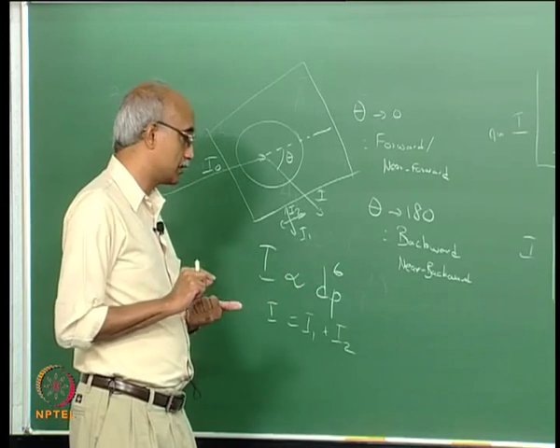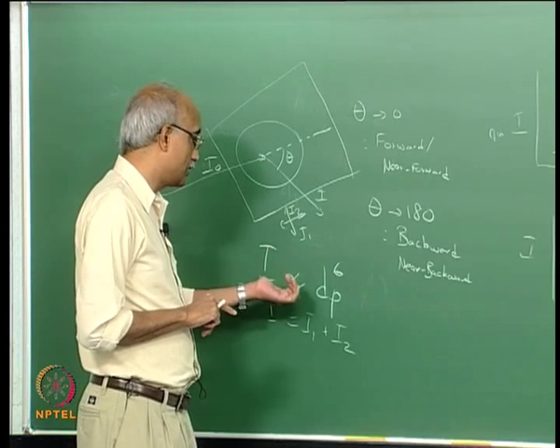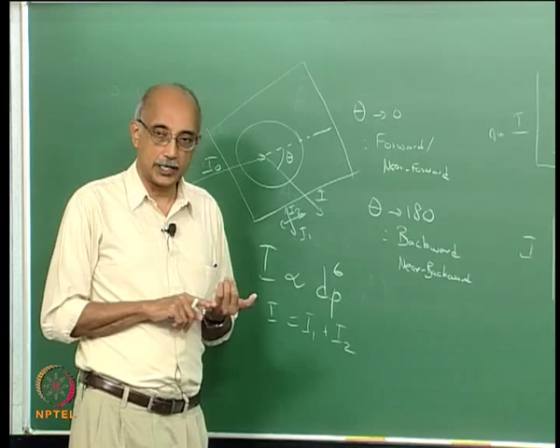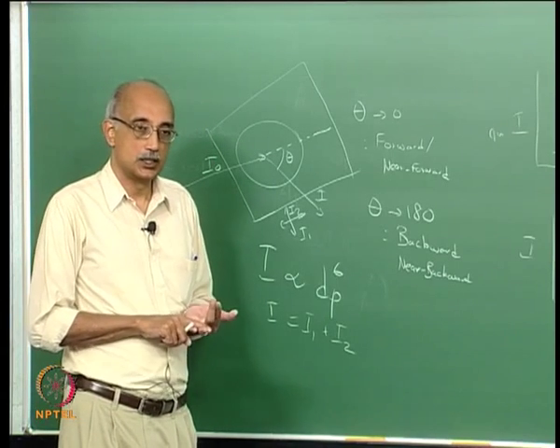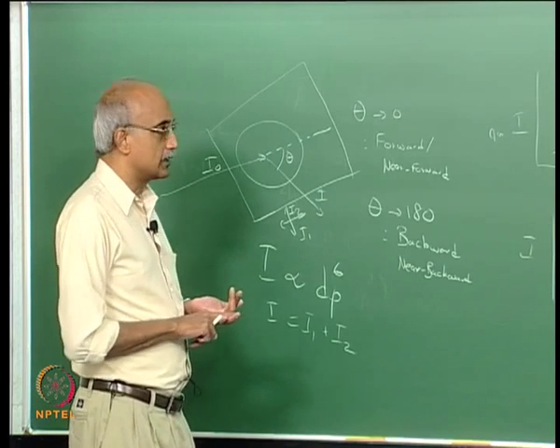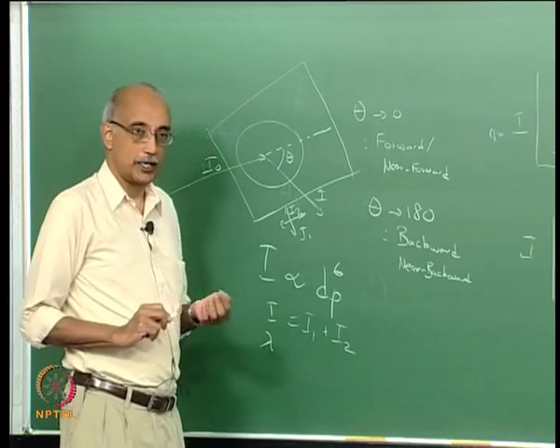So the assumption here is that shape is spherical, and given that, the scattering light intensity is dependent on particle size, on the degree of polarization of the light, and what else will affect it? Certainly the wavelength of the light, lambda, will play a role.